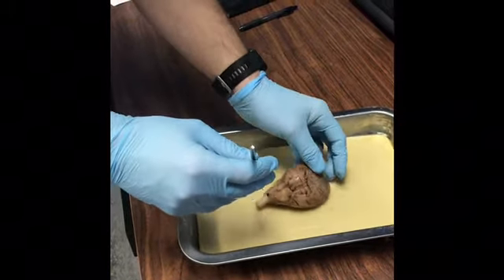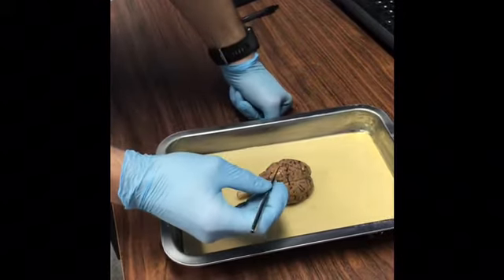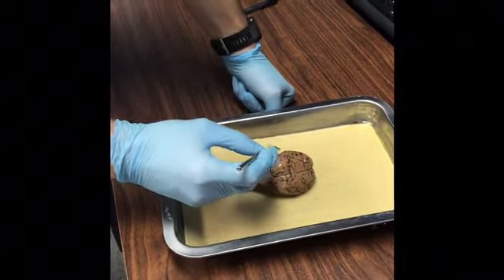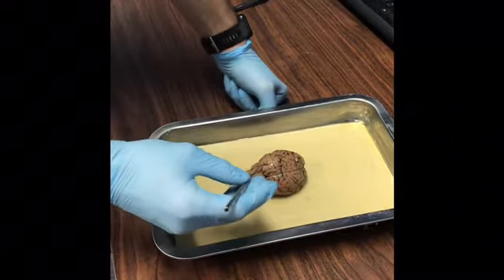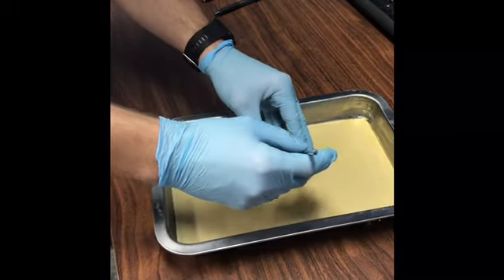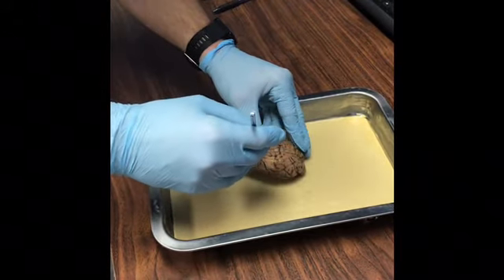I'm going to flip it over and go ahead and explain the cerebral, and the grooves is the sulcus. And then the gyrus are these parts right through here. And the longitudinal cerebral fissure is this line that comes all the way down through here.